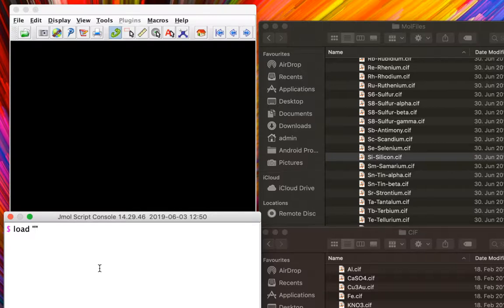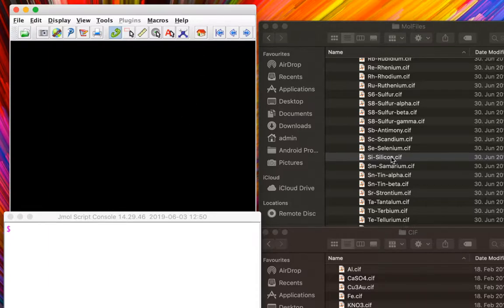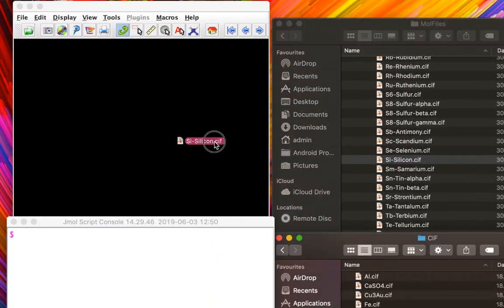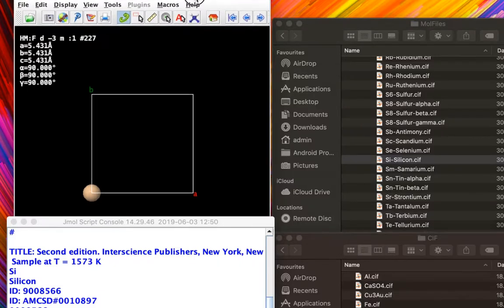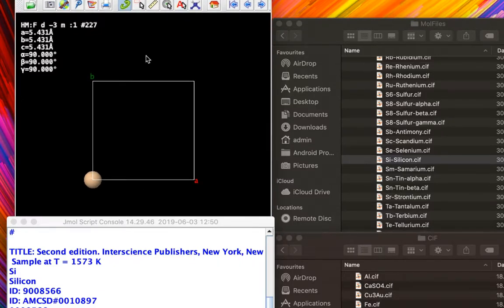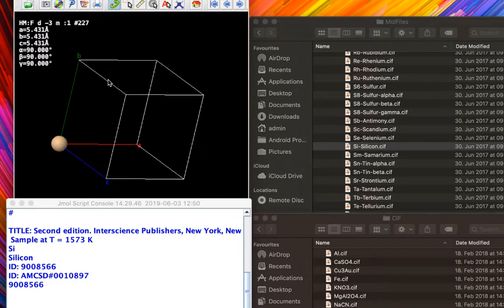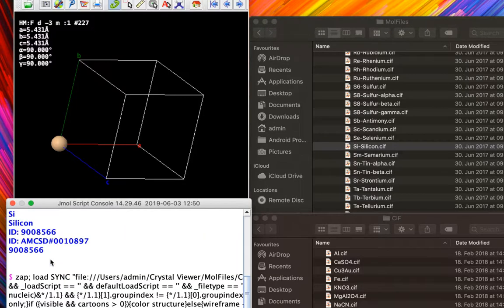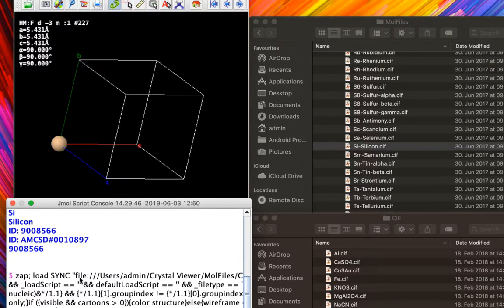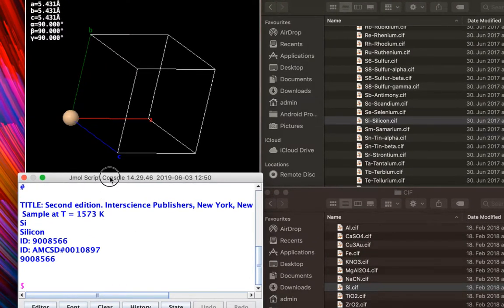You need to provide the file address within double quotes for the .cif file in order to visualize a crystal structure. To get the path of the crystal structure there's a really neat little trick I use: I just go ahead and click on the .cif file I want to visualize — in this case, silicon — and drag it over the Jmol window. What it does is it lets Jmol read the lattice parameter information from the crystal structure file and also visualizes a single atom, but this is not really useful for us. I'm only using this to get the address of the .cif file.